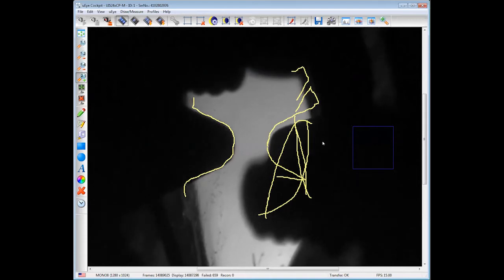Yeah. So as I said, we have some marks which tell us the distance should be the same as the size of the aperture. The size is 300 microns, and the distance is some 300 microns, more or less. So you can see that it somehow corresponds to this distance. This distance to the shadow should actually be double this size, but the hole is a bit smaller. So here you have more or less double the distance, because there is a mirror. The actual distance to the surface is somewhere here. So the beam is also irradiating this point on the surface.